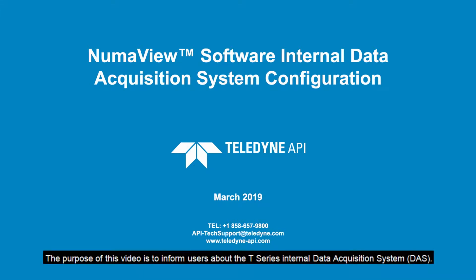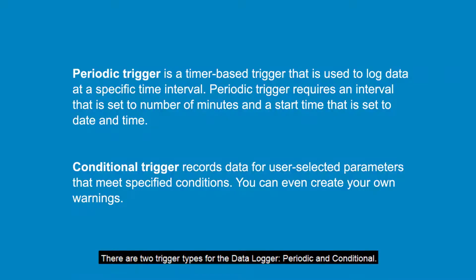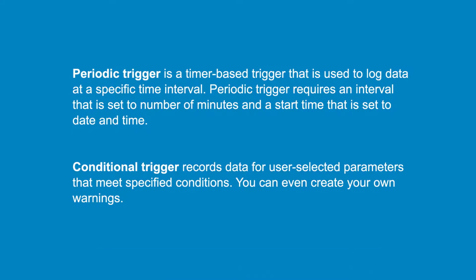The purpose of this video is to inform users about the T-Series Internal Data Acquisition System, DAS. The Internal Data Acquisition System is important because it can record helpful data for troubleshooting or diagnostics when the instrument gives abnormal values.